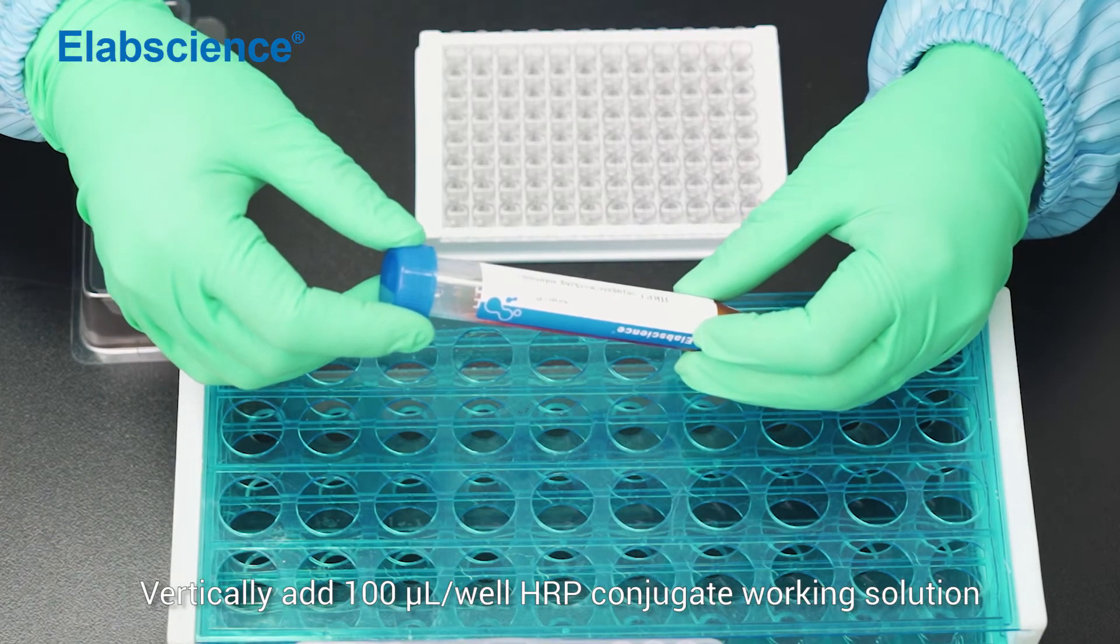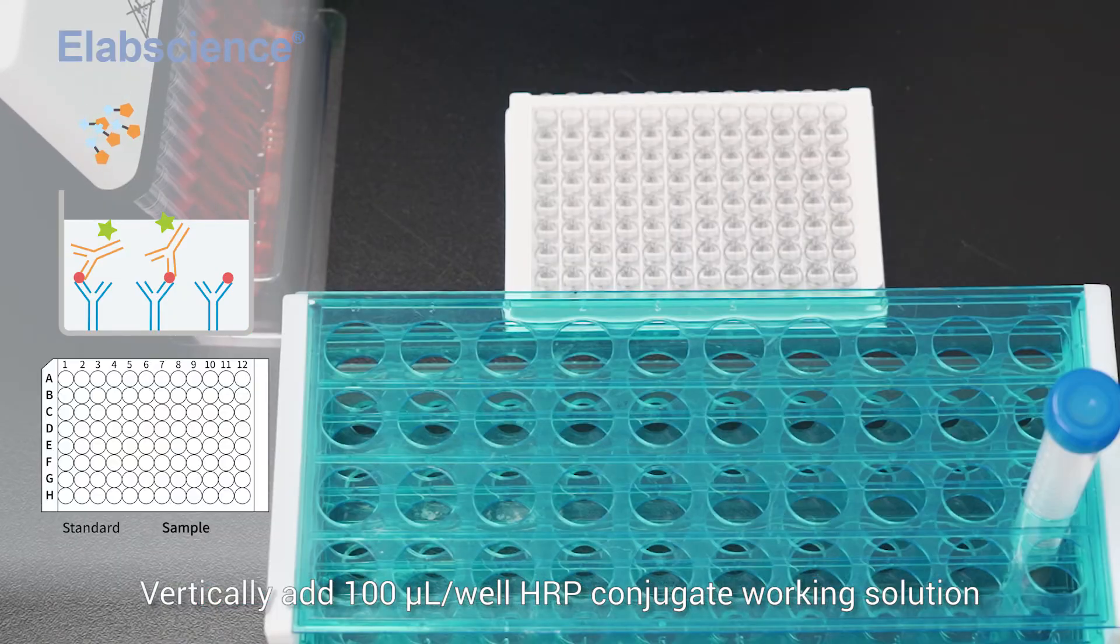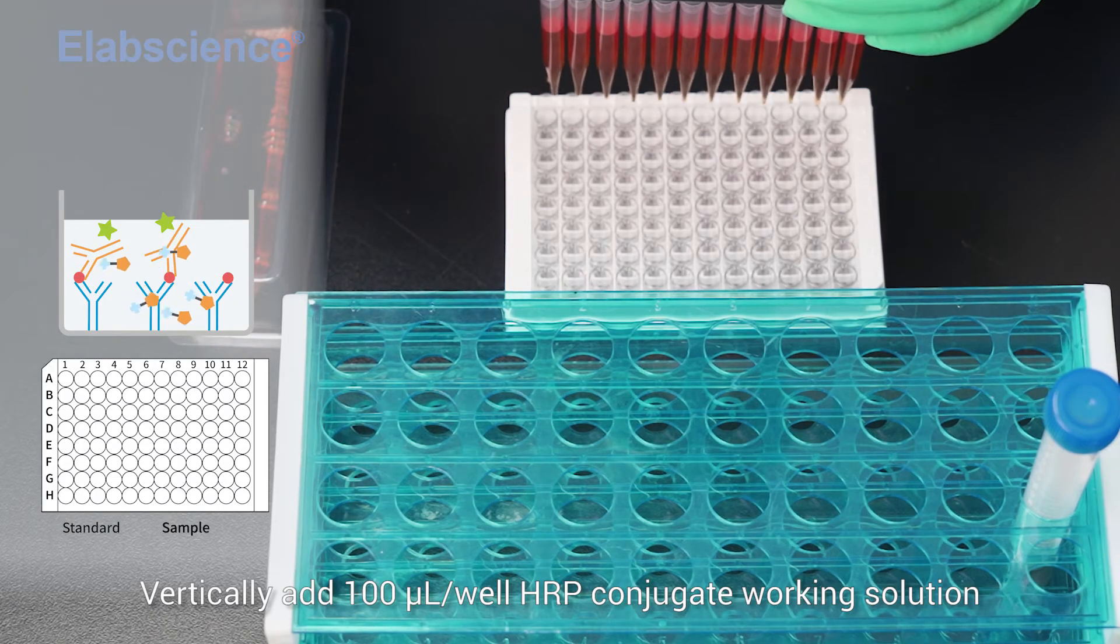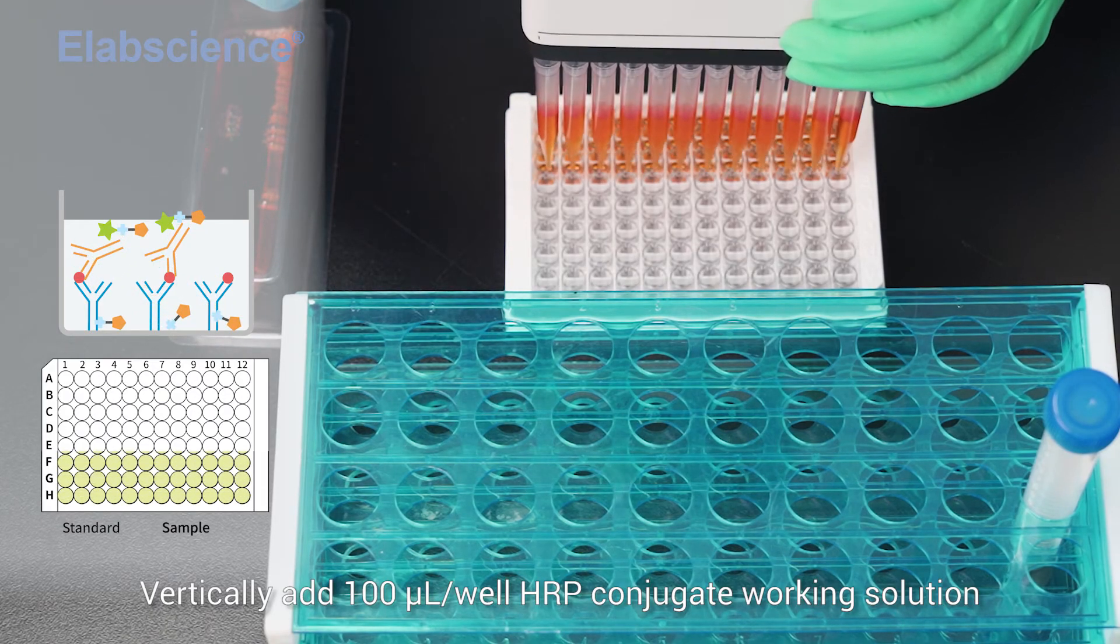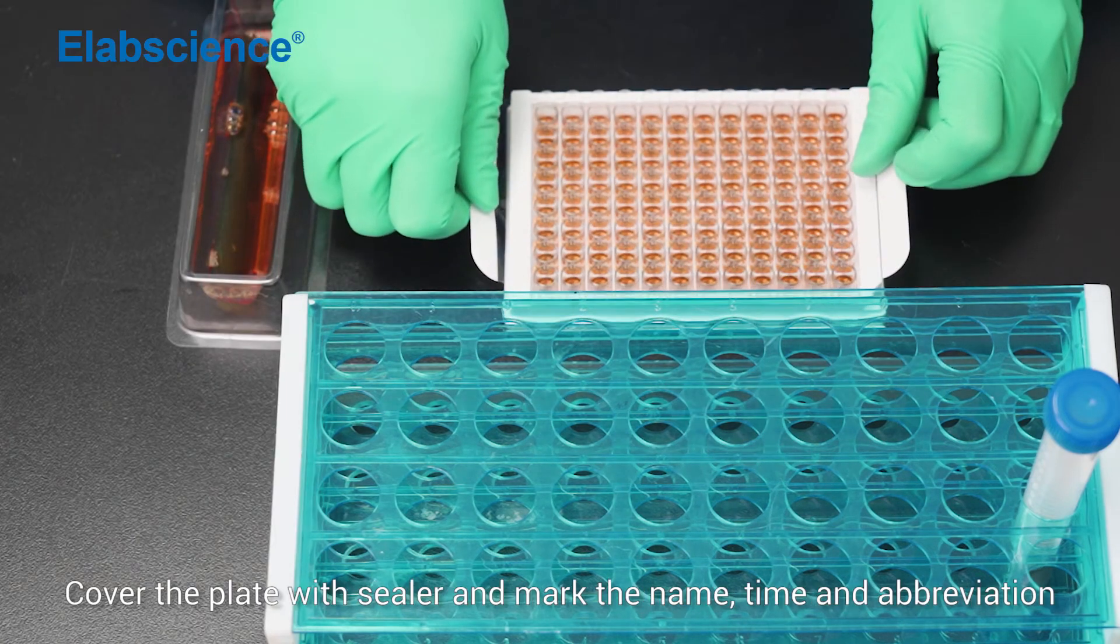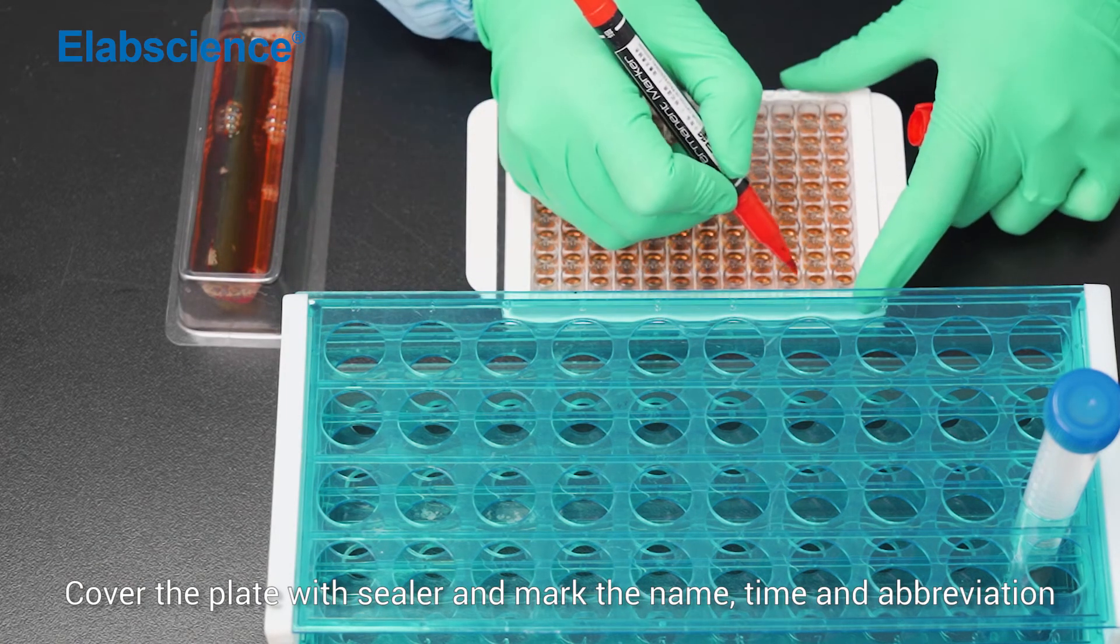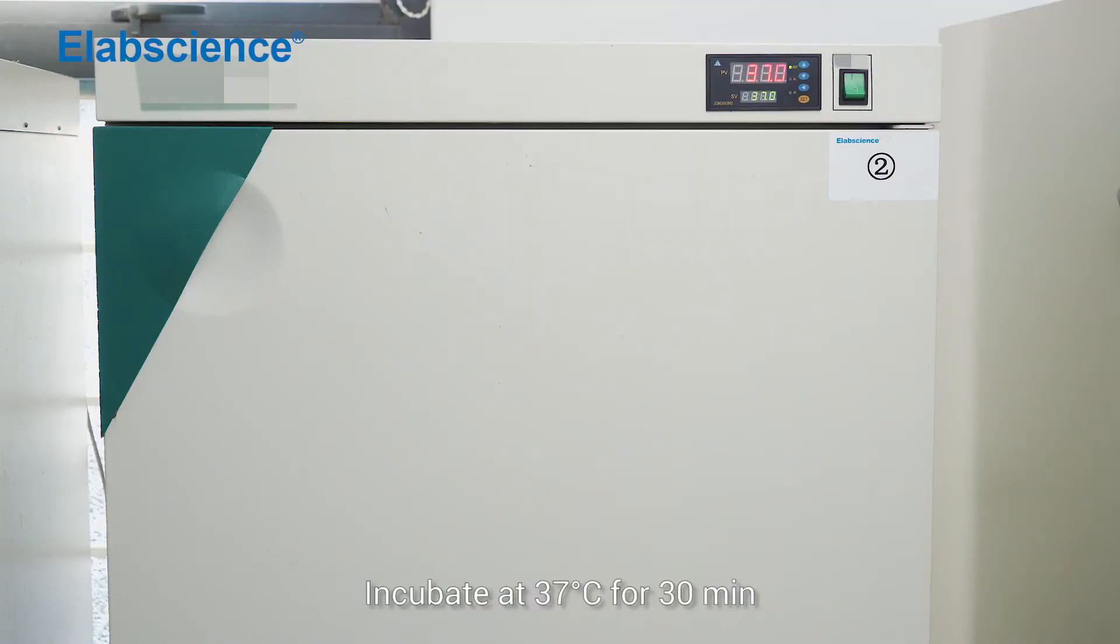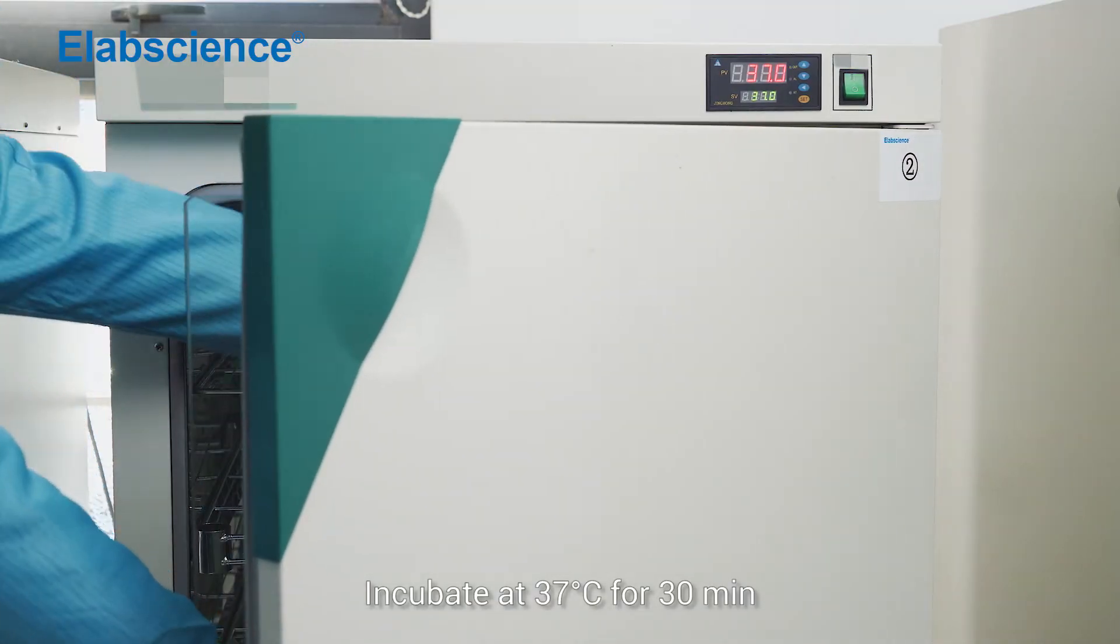Vertically add 100 µL per well HRP conjugate working solution. Cover the plate with sealer and mark the name, time and abbreviation. Incubate at 37 degrees for 30 minutes.